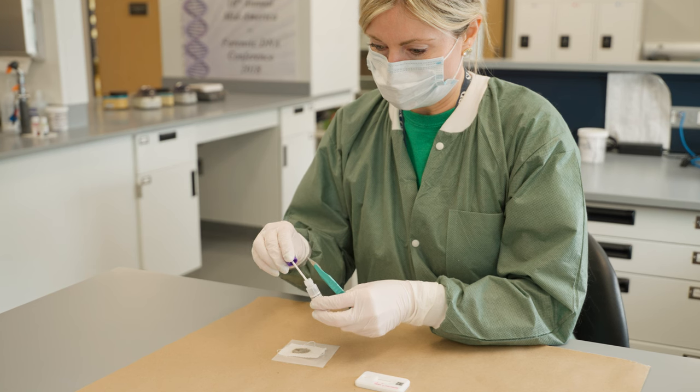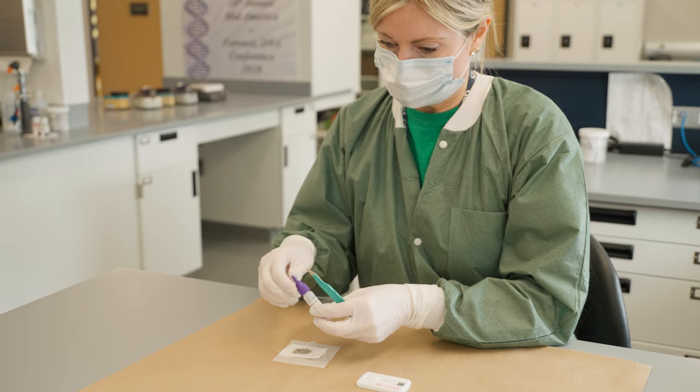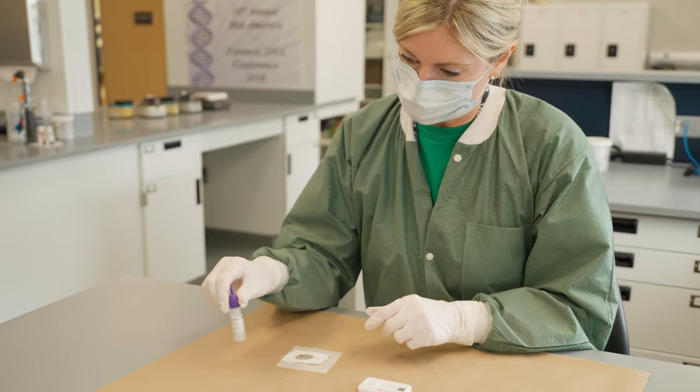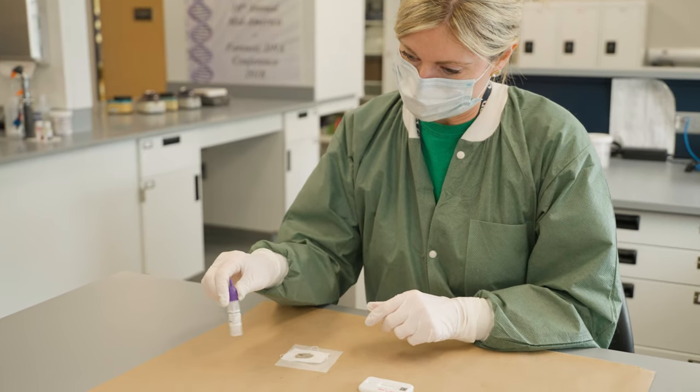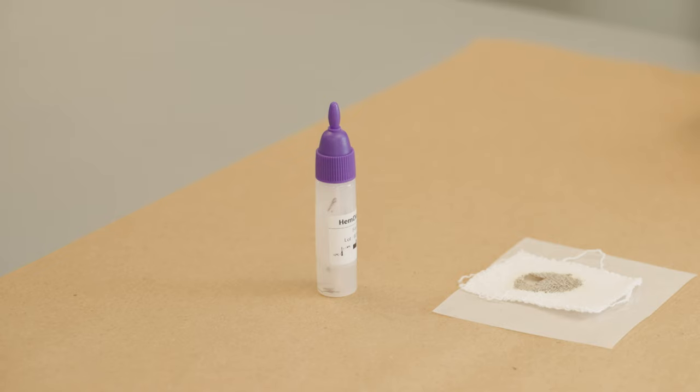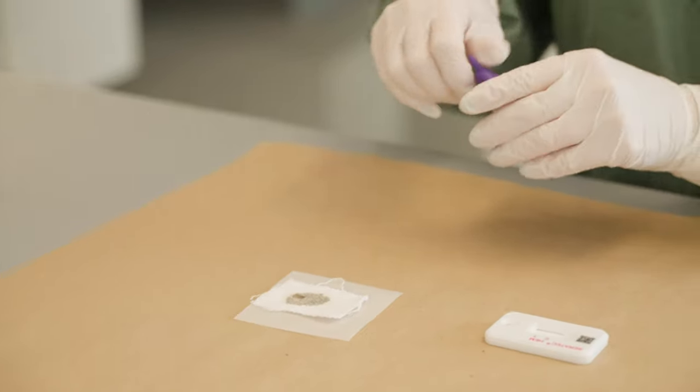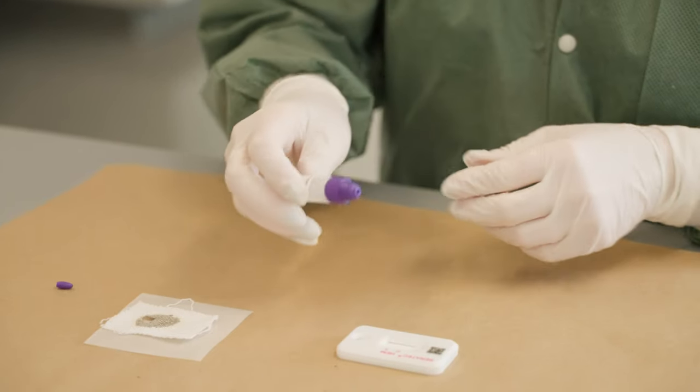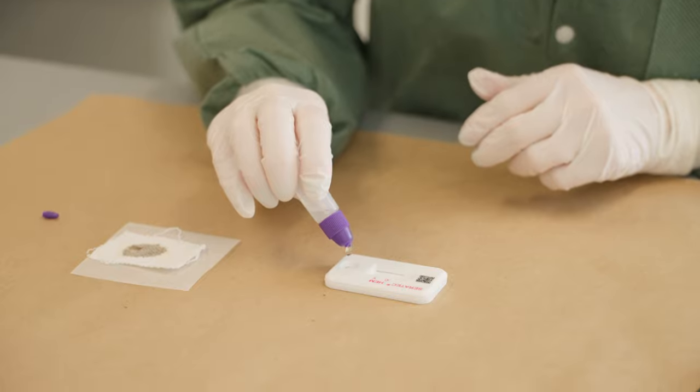This test is performed by cutting a very small portion of the sample to be tested. The sample is then added to the extraction buffer. The sample is vortexed and sits at room temperature for approximately 10 minutes. The tip is then snapped off of the top and several drops from the dropper of the extracted sample are added to the sample well of the testing device.